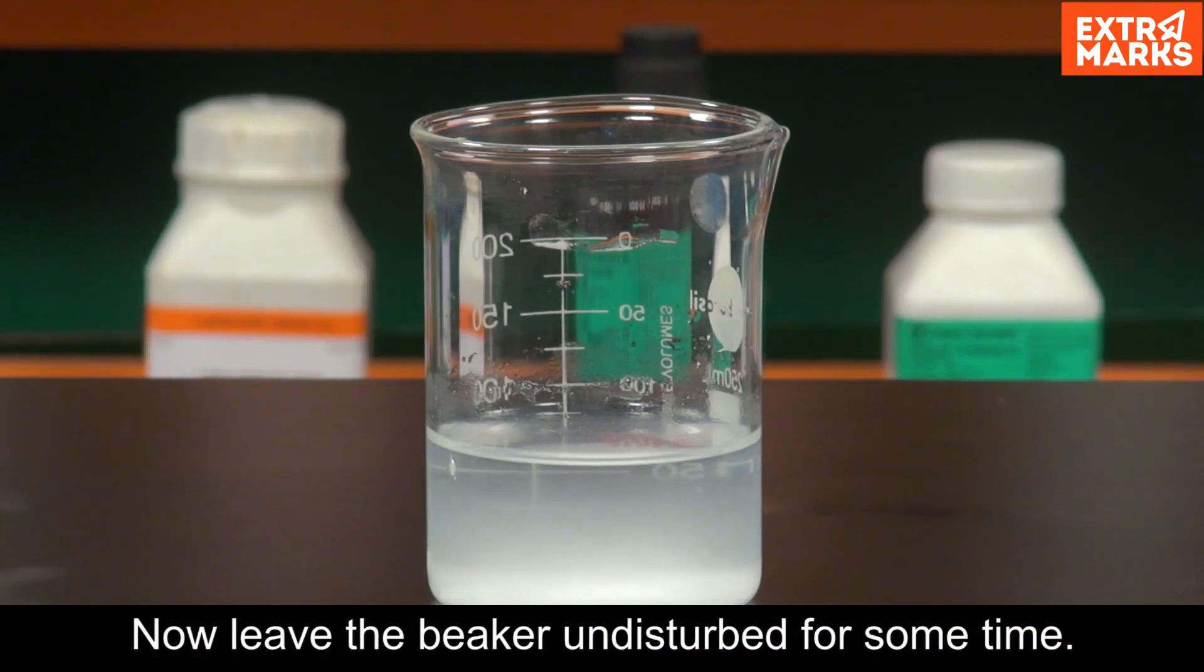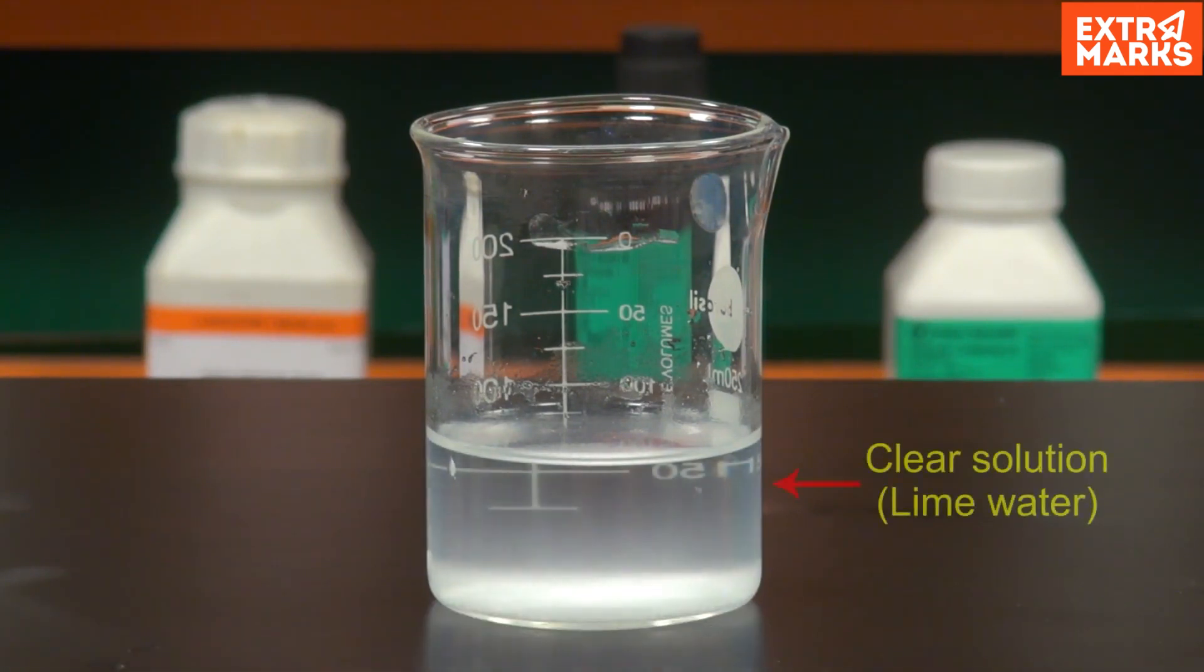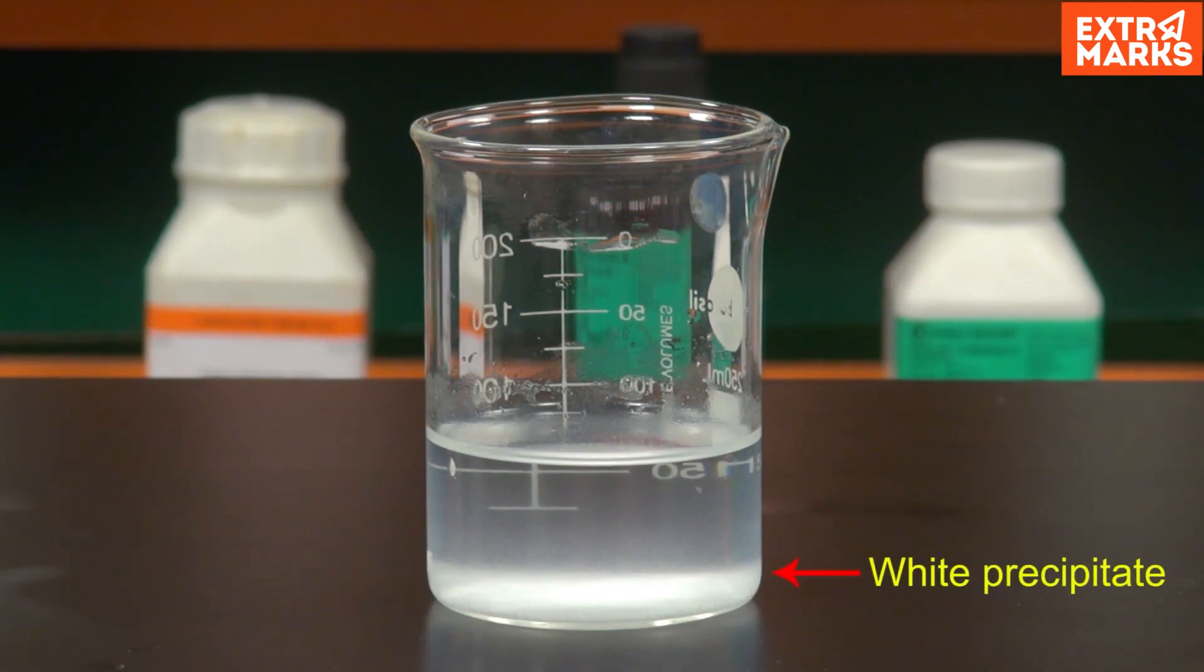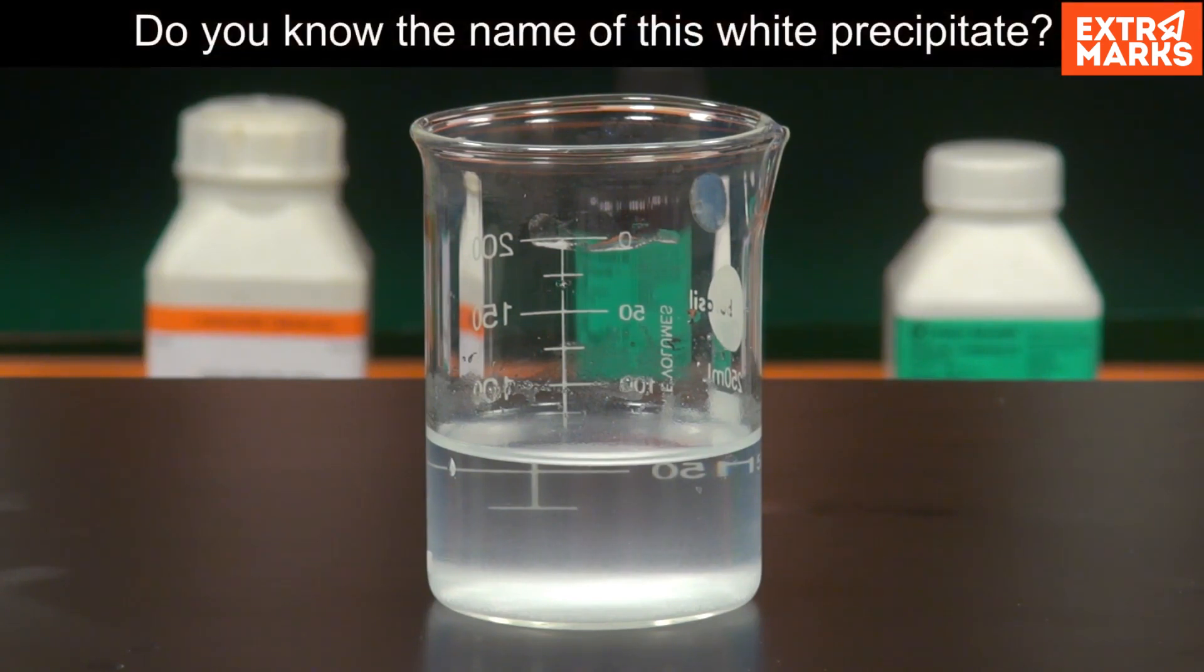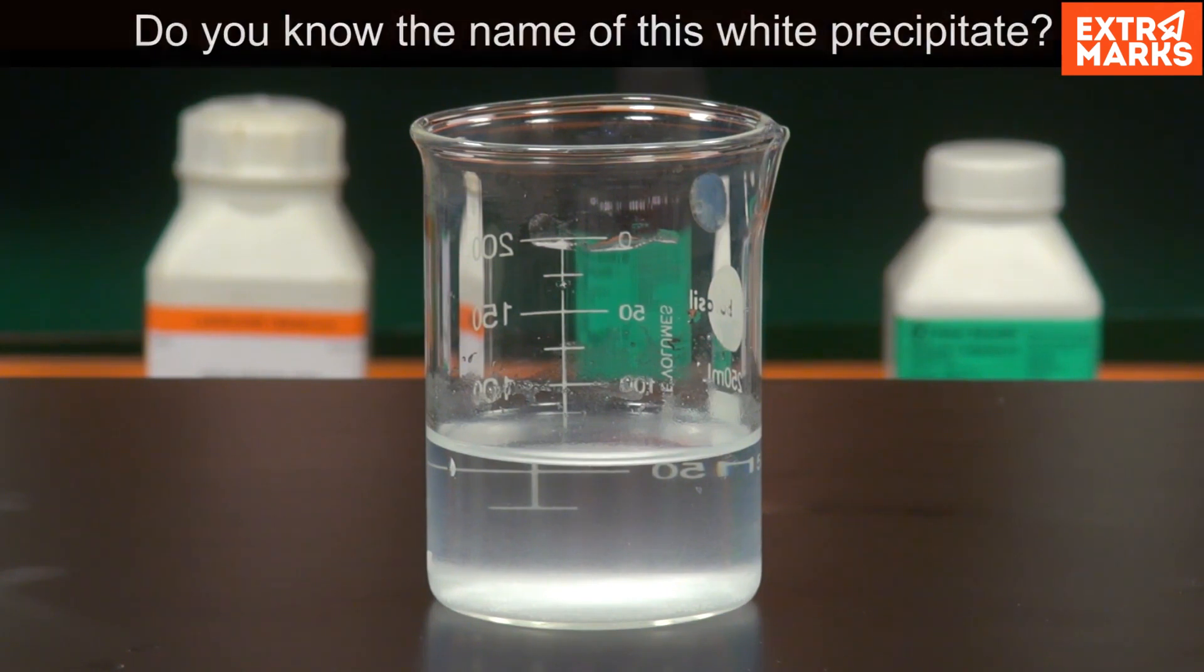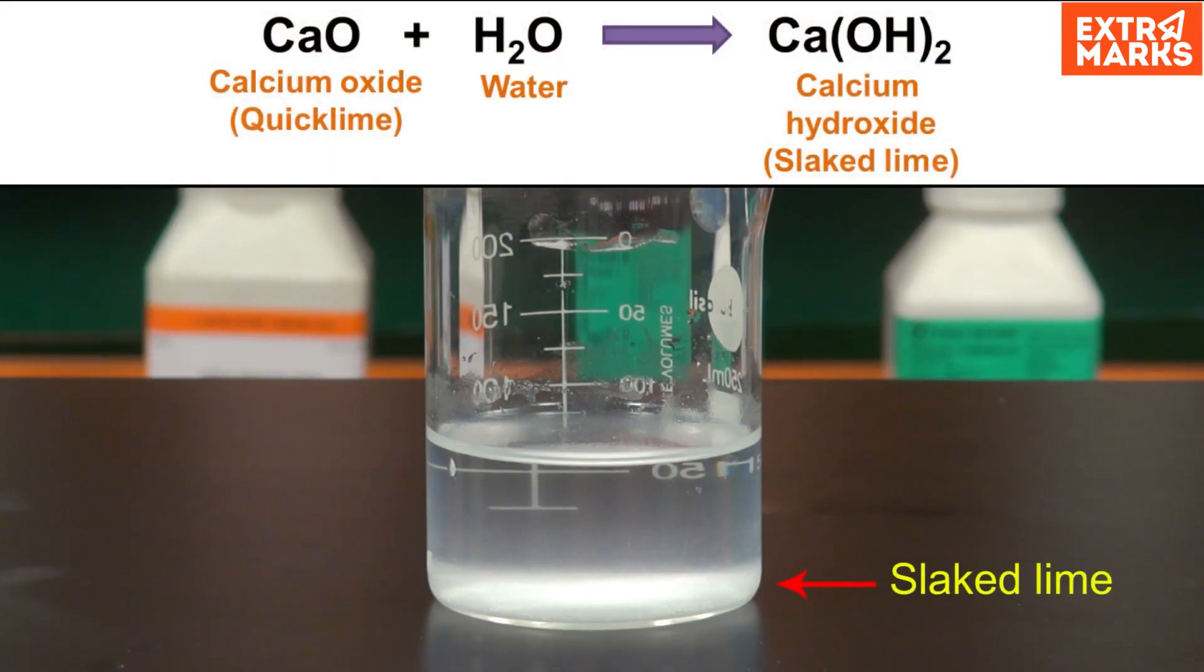Now leave the beaker undisturbed for some time. You will notice a clear solution of lime water as the white precipitate settles down at the bottom of the beaker. Do you know the name of this white precipitate? It is slaked lime.